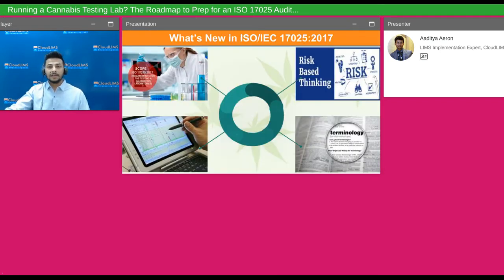So what's new really in ISO IEC 17025? In 2017, there was an update released, and it had about 4 important points, starting with the first quadrant, where we've got risk-based thinking. This basically gives you an idea of wearing a black hat when you analyze your laboratory's future.